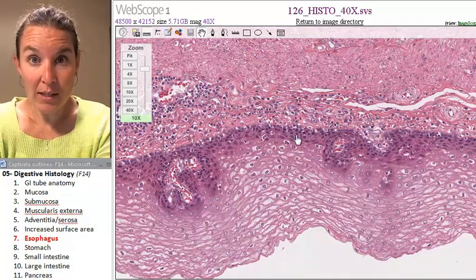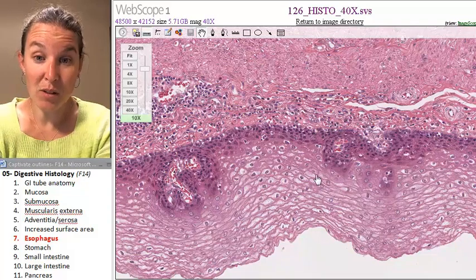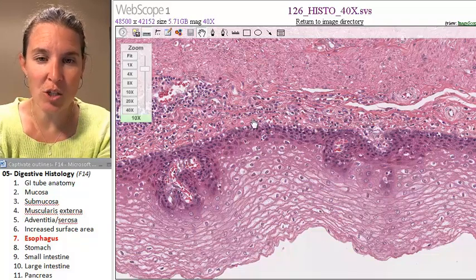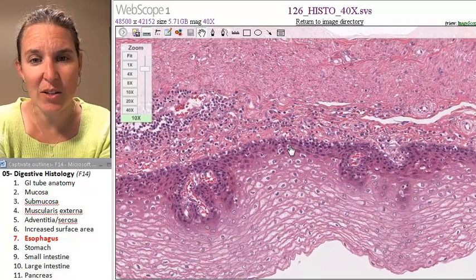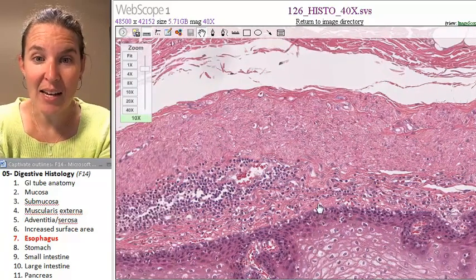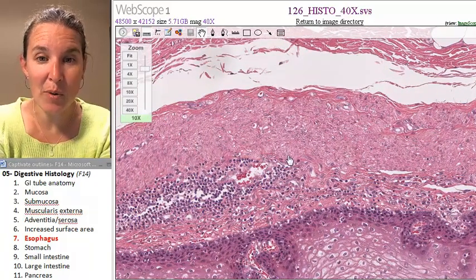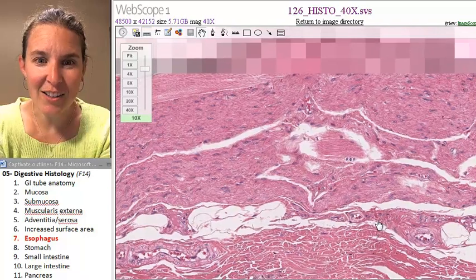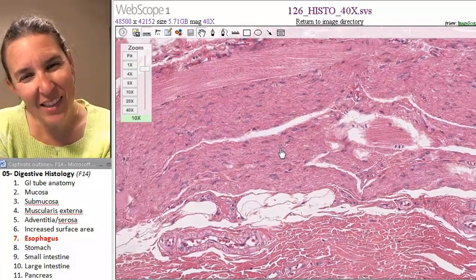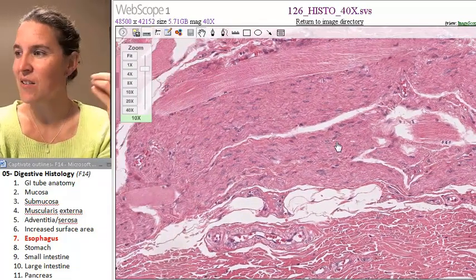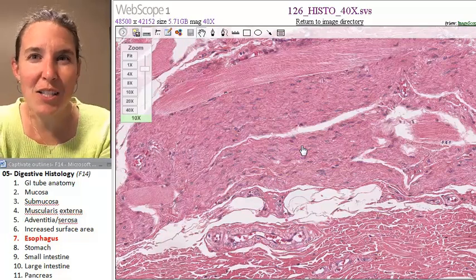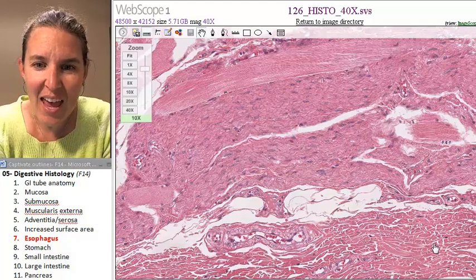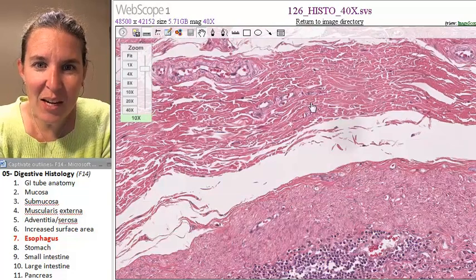If you remember what stratified squamous epithelium looks like, this is actually my basolateral edge. My basement membrane for this epithelial tissue would be found right about here. Deep to that is going to be my lamina propria. And then deep to that, there's smooth muscle. It looks smooth, and the nuclei are kind of elongated.